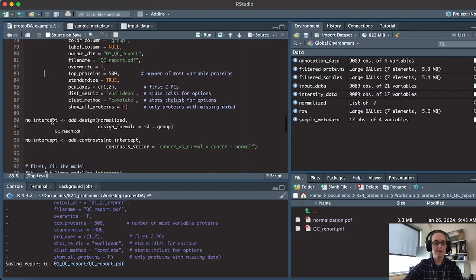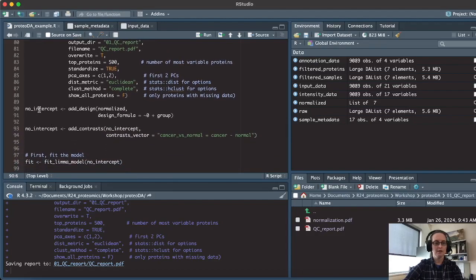So now the next step, and this is really the power of this particular package, because if you're like me, kind of struggle a little bit with really having to think through the model matrix design for how do you want to set up your statistical design. So we try to make this process a little bit simpler to be able to run your analysis. And I'm going to make another video that goes into a lot more detail about normalization methods and a separate one about the limma model designs.